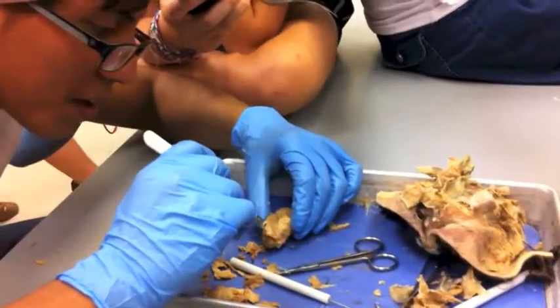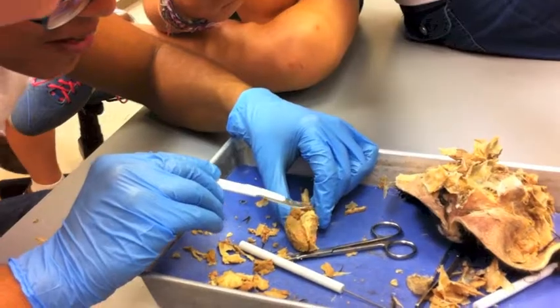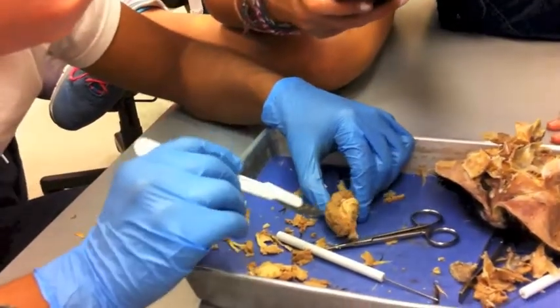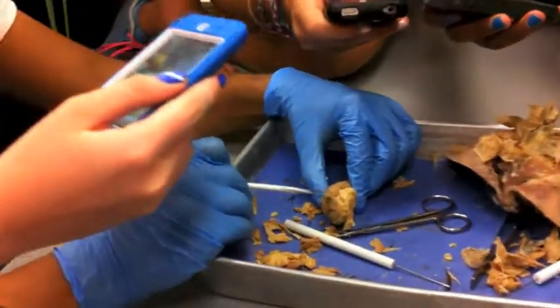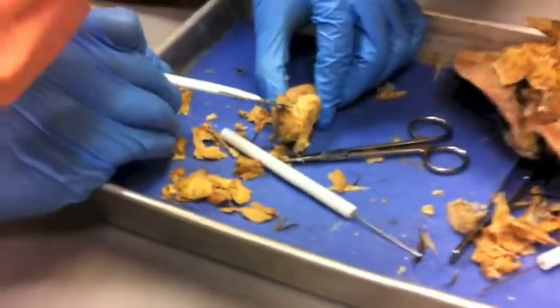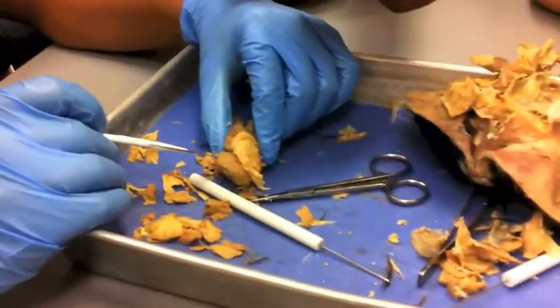Alright, so you see, it comes from in there, like a ram. Oh yeah, so cool. I just snicked the back because I wasn't sure where it started. Hey, don't move your hands. That edge is so smooth. Between that and the other cortex, that space is so smooth.